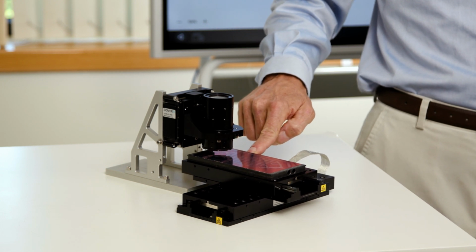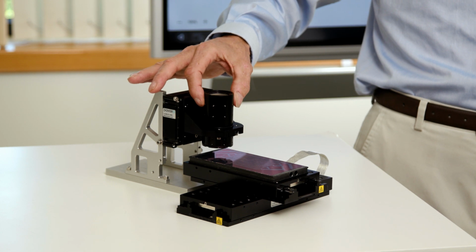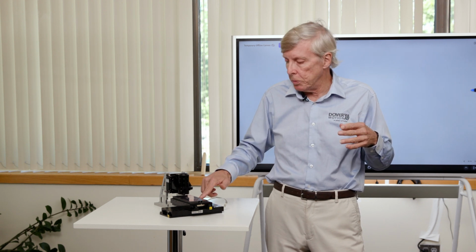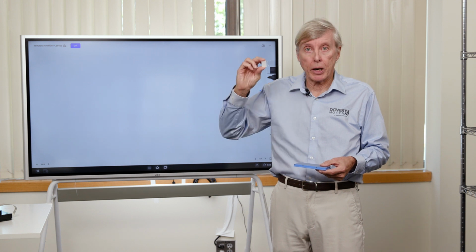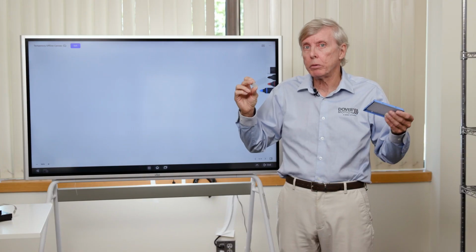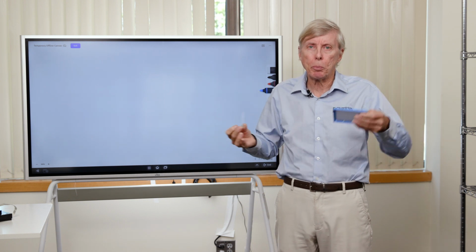And similarly, especially if the depth of field is very shallow due to high numerical aperture objectives, we have to have a Z focus stage that retains the image in crisp focus as we move across the sample. In addition to the sample that we've shown there, which is a flow cell, other common samples include microscope slides, which may be presented one at a time or in an array of more than one, 4, 8, 16. They can also be fed by a magazine, input and output.